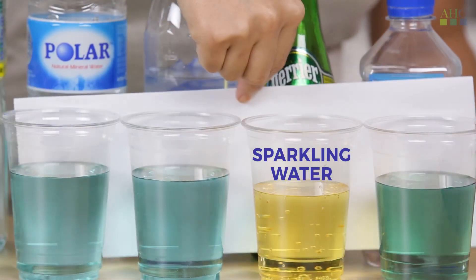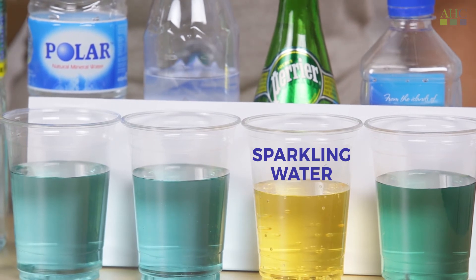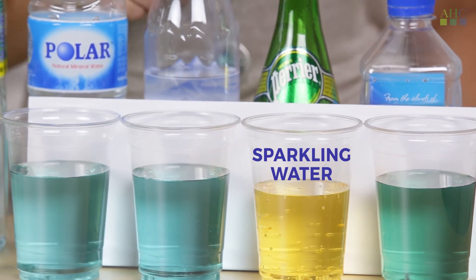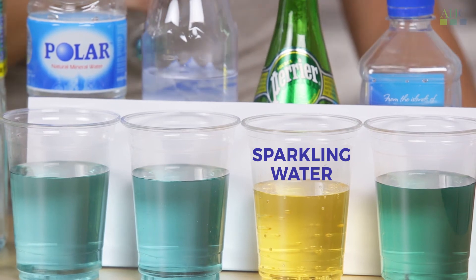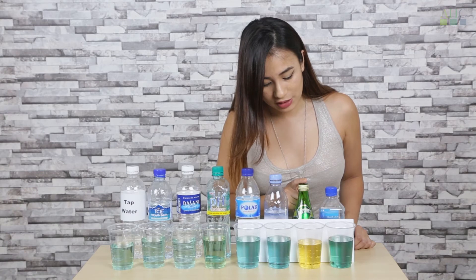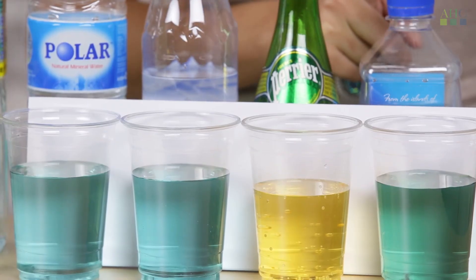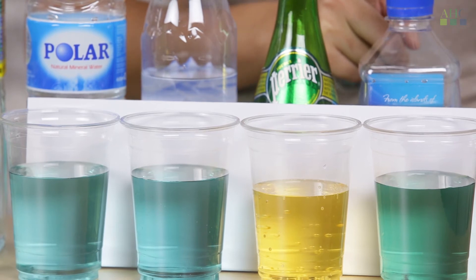So here are the next four. For this one, it's slightly more blue, so it's moving on from neutral to more alkaline. This is a darker blue, so it's a little bit more alkaline. For this one, it's definitely very yellow, which means it's very acidic. And the last one is very green, so it's definitely neutral.